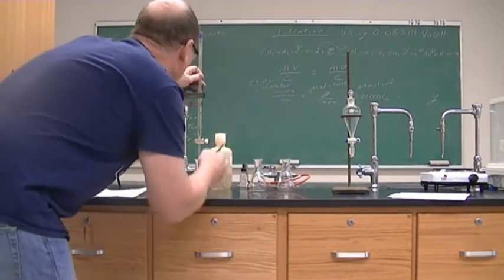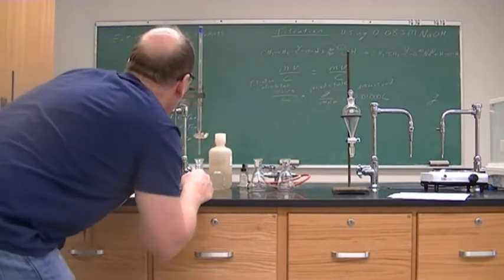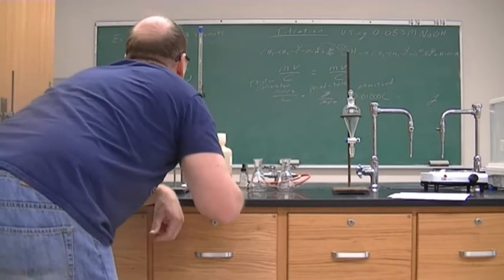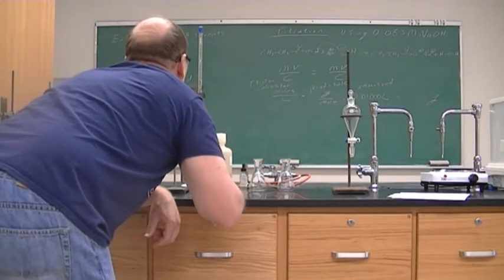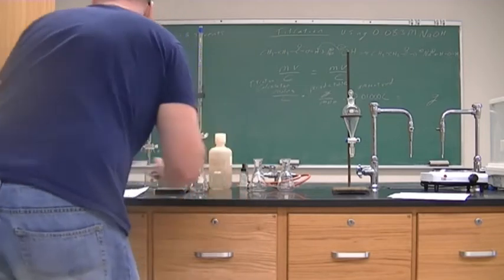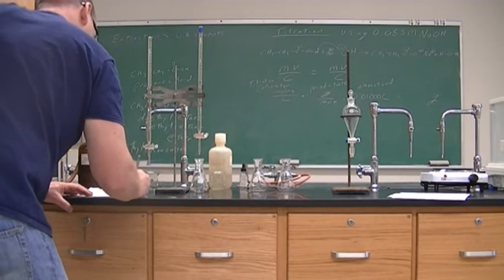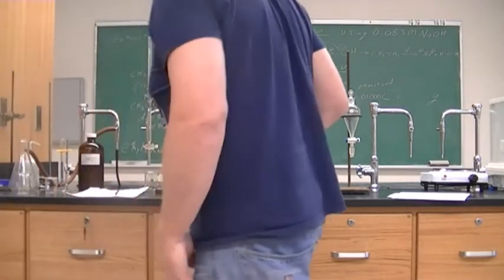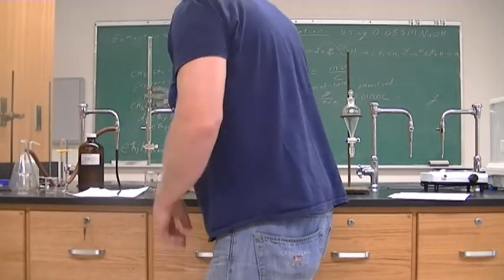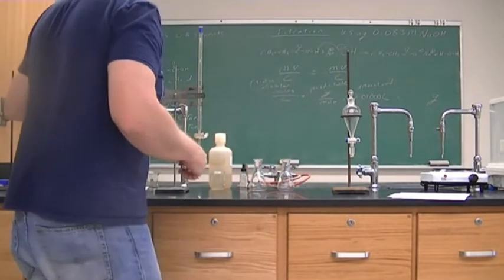So our final reading is 12.88. So 12.88 milliliters is our final reading. All right, so that is the first titration.